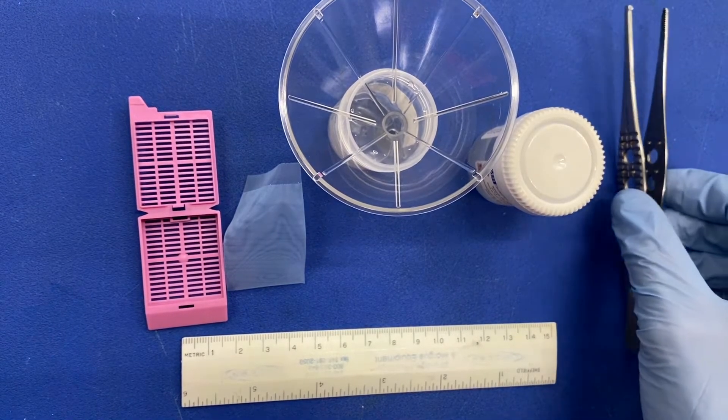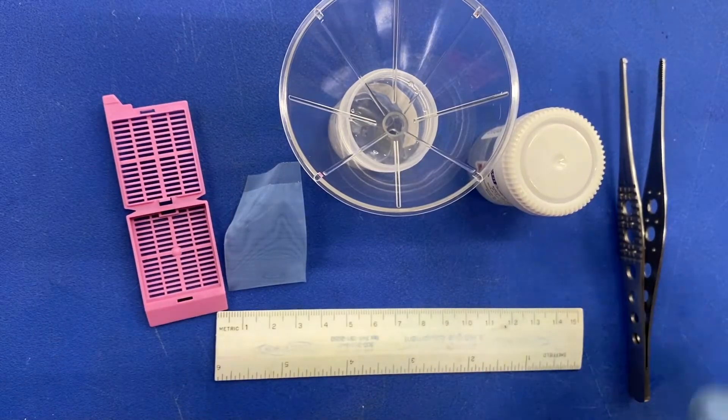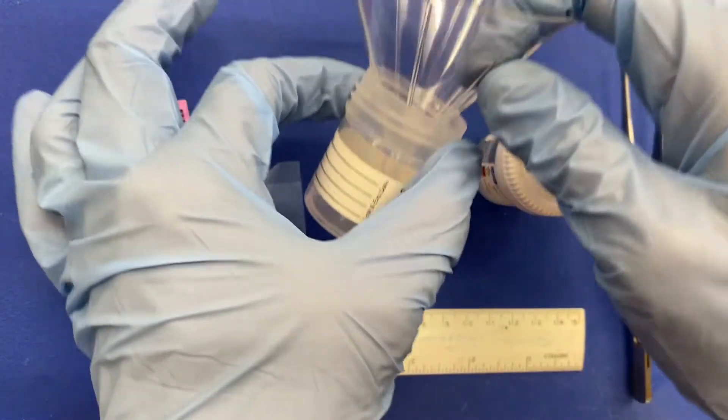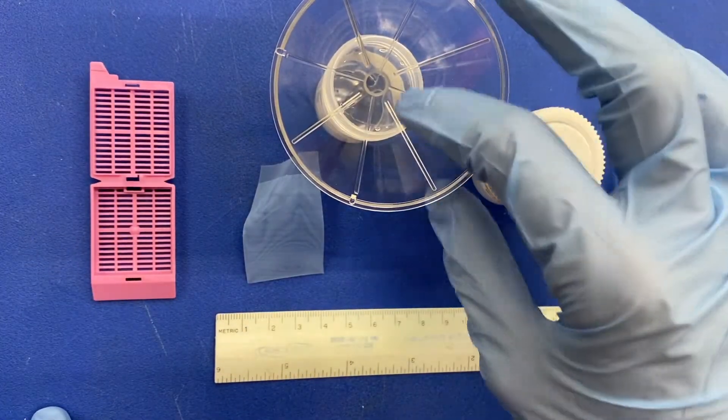You will want to have forceps, a ruler, an empty specimen container, a biopsy bag, and a small funnel in order to proceed.